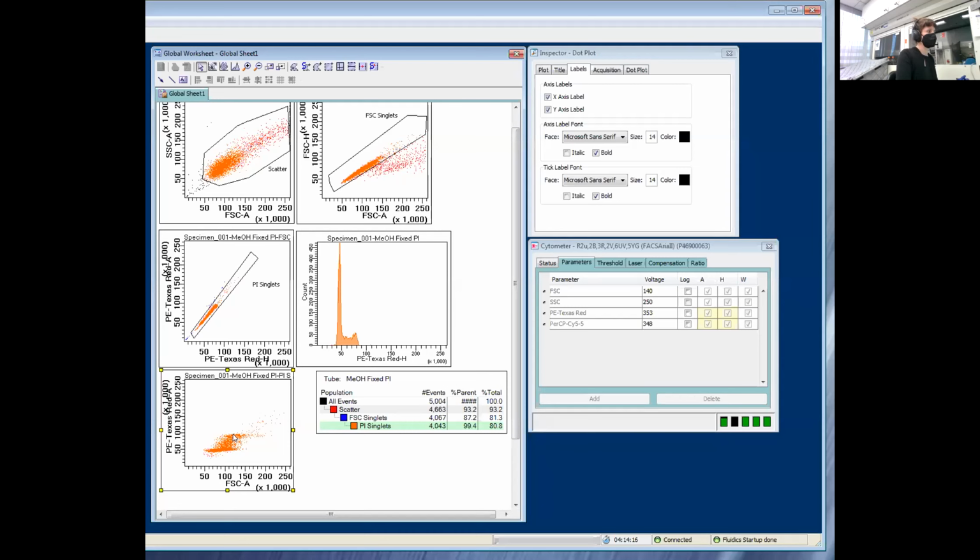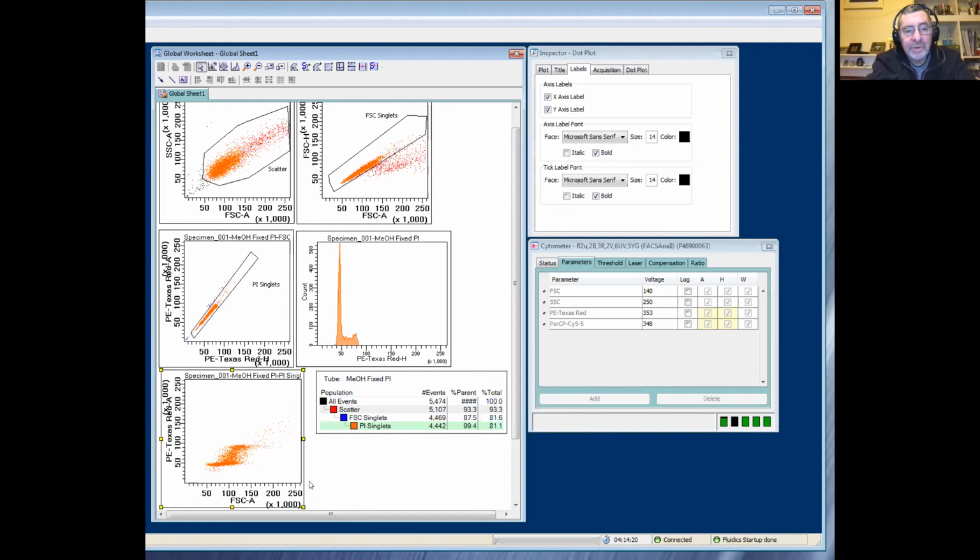So that's just what we want to see. And this is a nice plot that we can use to QC our instrument, because we're looking at high resolution data, we're only looking at a doubling of fluorescence. We want to put as many things up on the screen that will help us be reassured that the machine is working okay. So although we only have one fluorochrome in here, we've got 5 plots up when we're running our samples. Exactly.